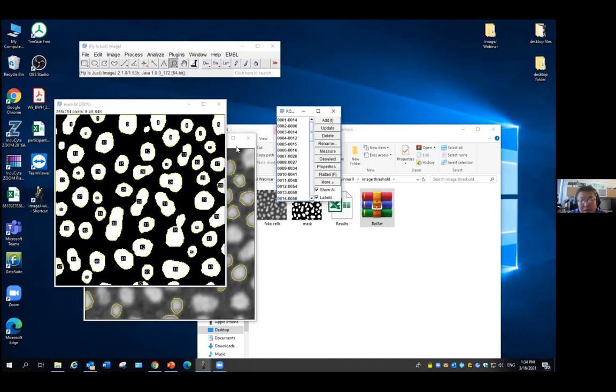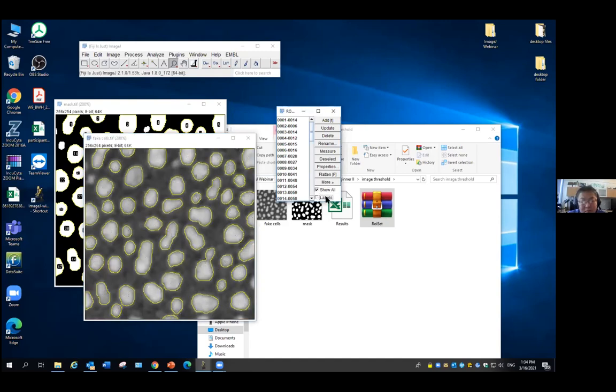I would say this looks pretty good. I identify the cells, and I don't count all the smaller ones, which are the dead ones. But you may still find there are some other problems in this case.